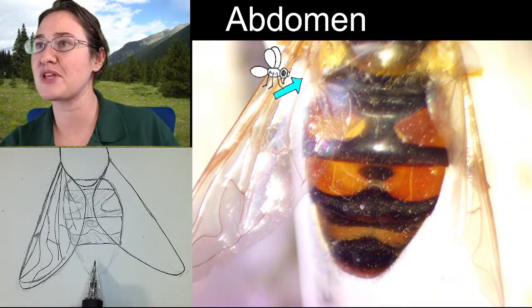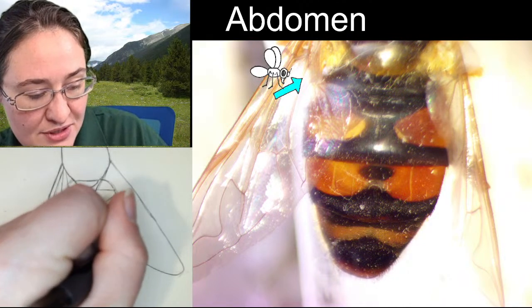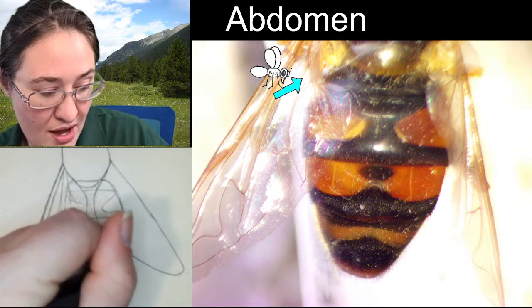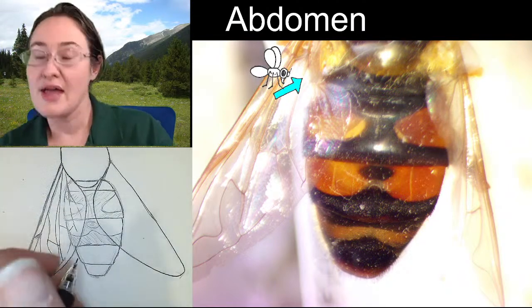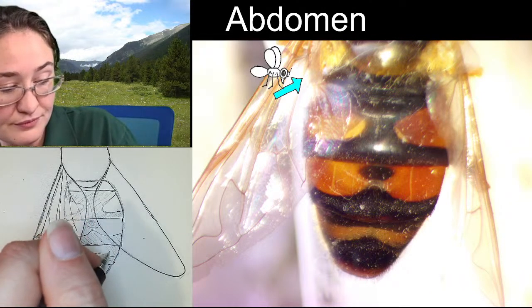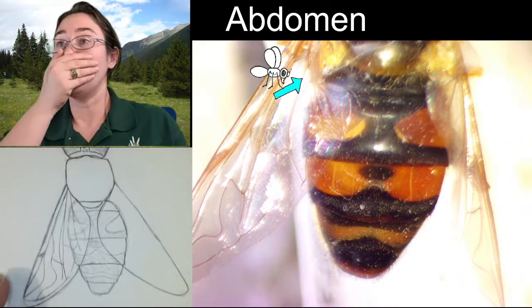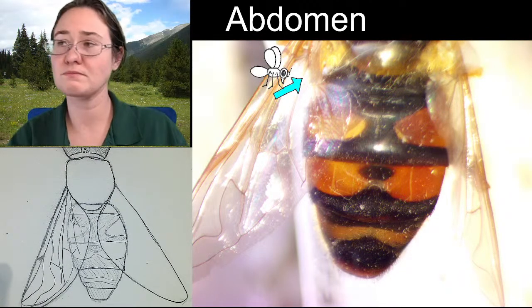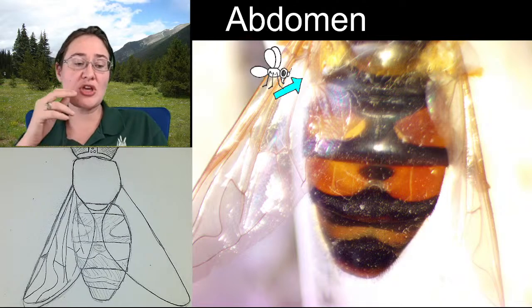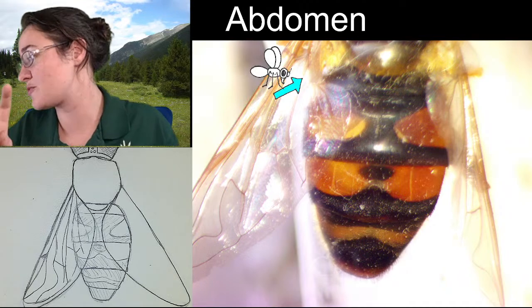Now, after this, I believe these last segments are actually two segments. They just look very similar in shape. So we've got one, and then we have two. And then we've got that really pretty kind of yellowy line right here in the center. All right. So we have the head, the thorax, the abdomen. We were able to look at the wings. We were able to look at the spurious vein.